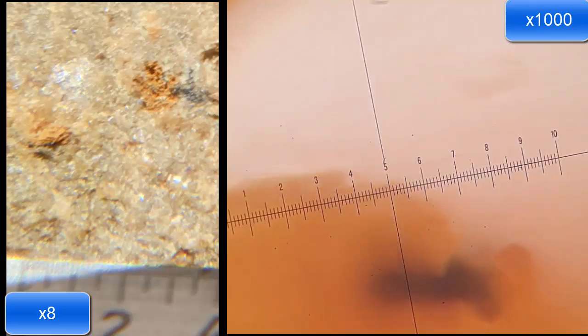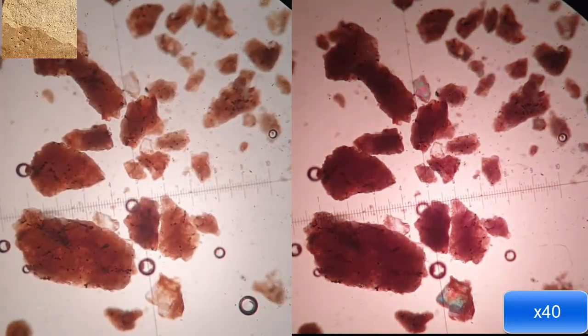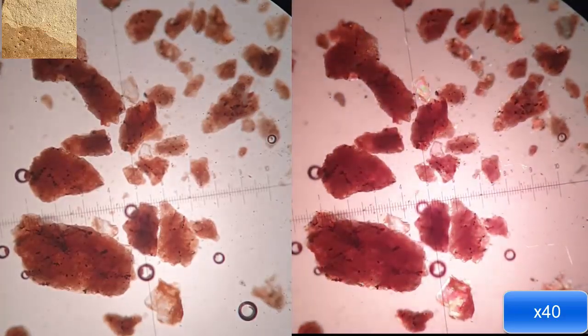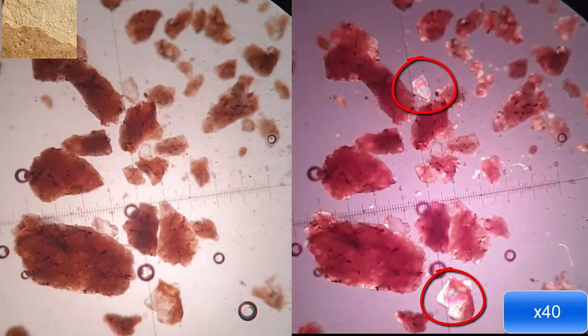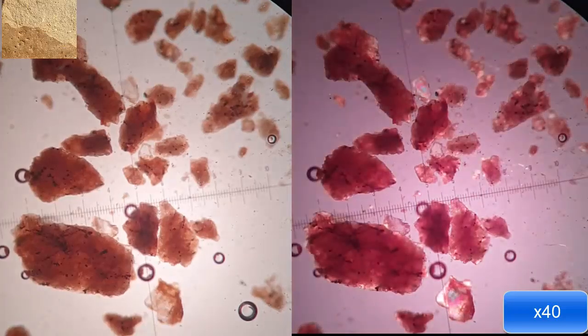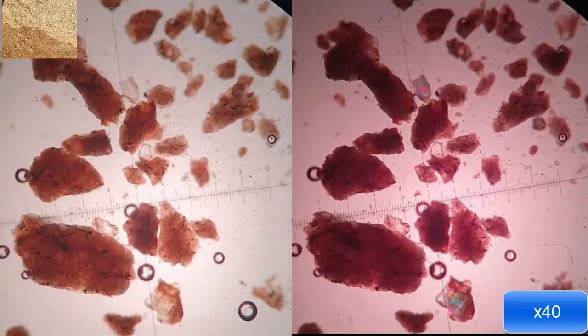And so in the top left-hand corner, that's what it looks like. And we've got brown rocks like that all the time. But you can see here that it's just amorphous. And then there's large pieces of quartz, and that makes no sense. And then there's little black bits, but they're not augite. They're irregular. And so it's not sort of some siltstone meshed together.